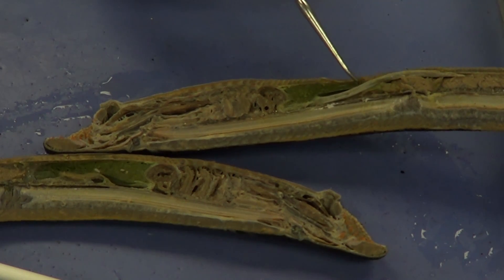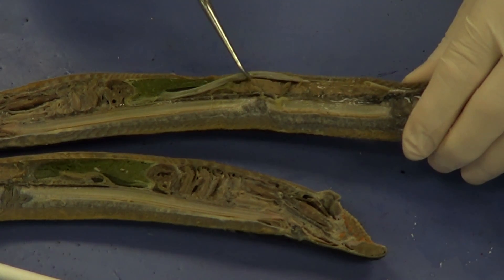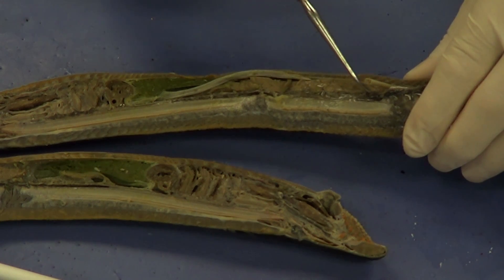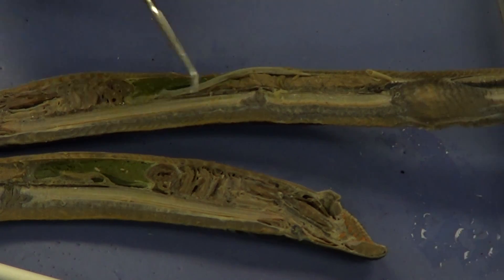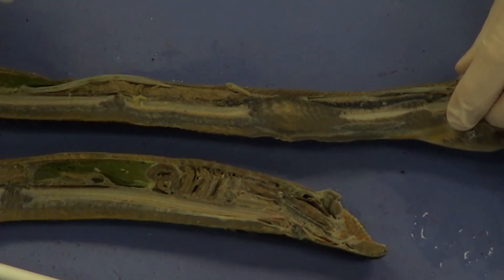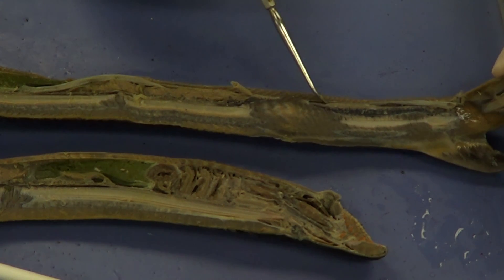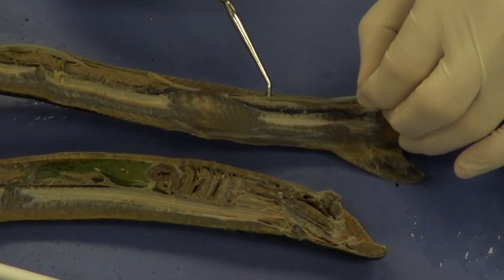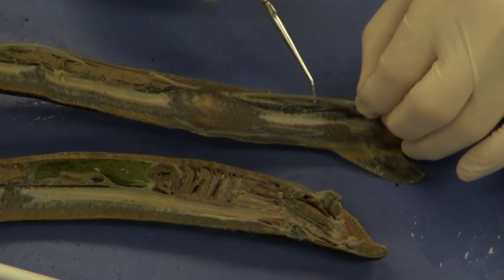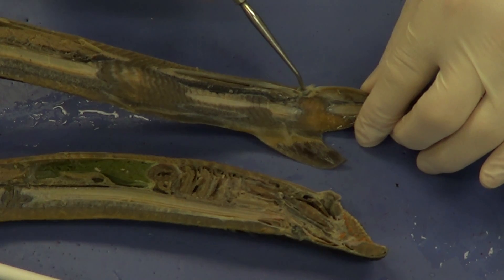We've got the liver on this side, and you can see all of this area right here — this is all going to be gonad, either testes or ovary depending upon the sex of this lamprey. The intestine is going to move all the way down — you can see a bit of the intestine right there — and it's going to end right here in the anus.